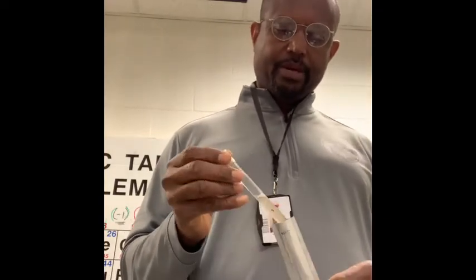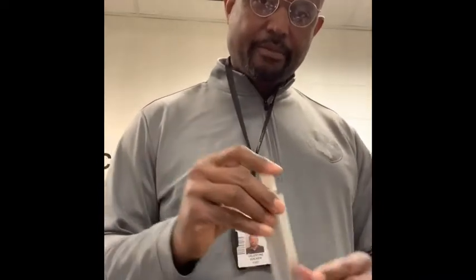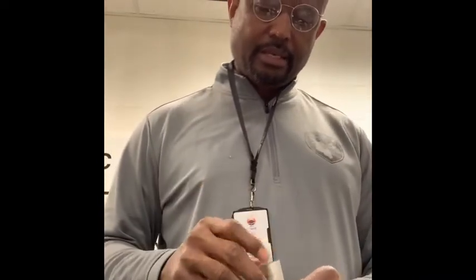And then we're going to wait for about 5 minutes for the nitrate test to be completed. So we leave this in here for 5 minutes, and we'll come back and look at it in a couple minutes.